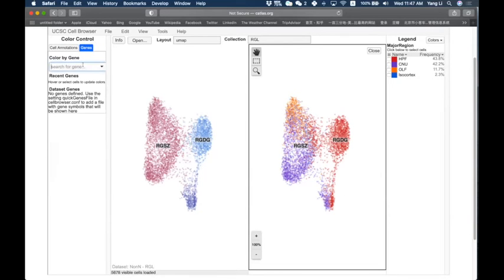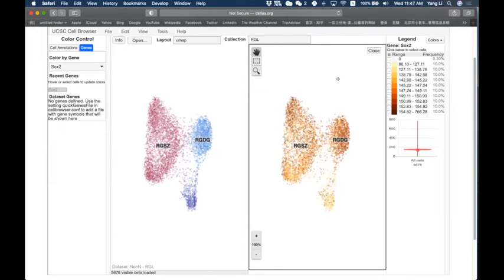You can also check out your genes of interest. For example, we know SOX2 is quite highly expressed in the radial glia-like cells from the subgranular zone. Here I'm checking the open chromatin signals at the promoter region, as well as the gene body, for every gene. But I need to make this clear to everyone: this does not mean this gene is expressed. Here I'm only showing you the open chromatin signals for every gene.